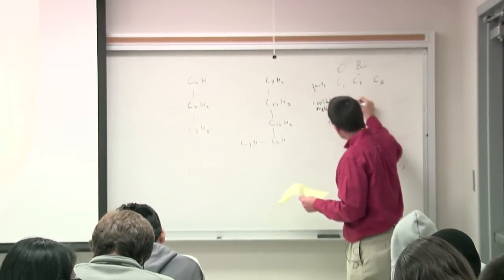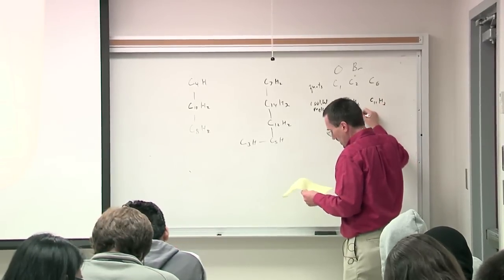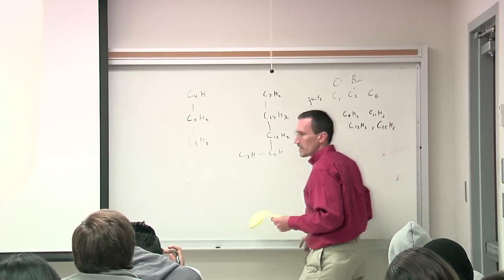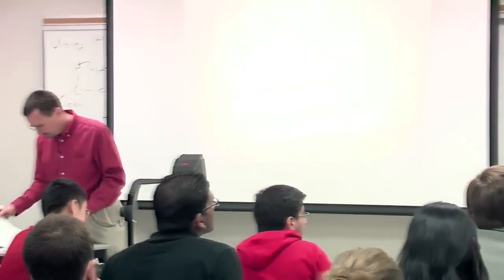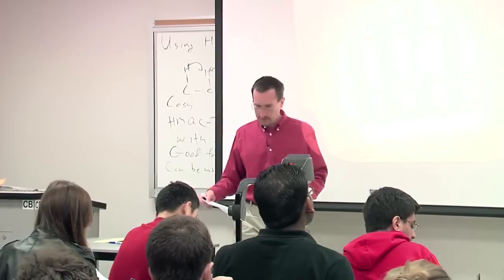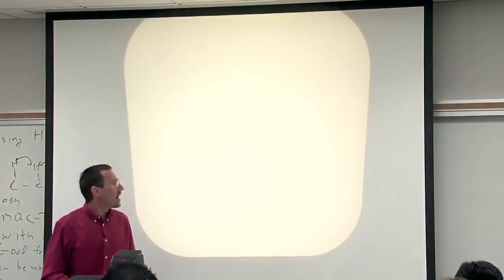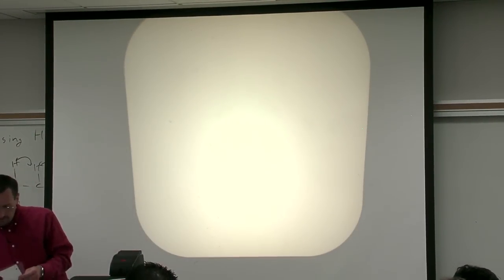And so we have C9H3, C11H3, C13H3, and C15H3 that we need to put together. All right, at this point, for putting the pieces together, I'm going to turn to the HMBC spectrum.